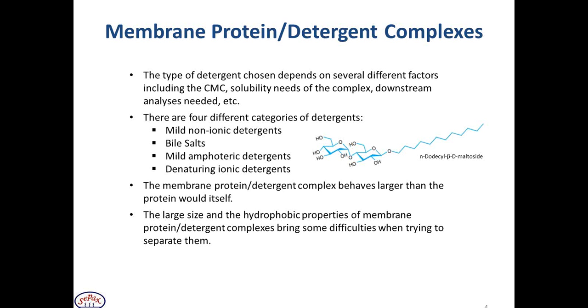In complex with the detergent, the membrane protein behaves larger than the hydrodynamic volume of the protein alone. This large size, along with the hydrophobic nature of these complexes, can sometimes add difficulties when trying to analyze them by size exclusion chromatography.